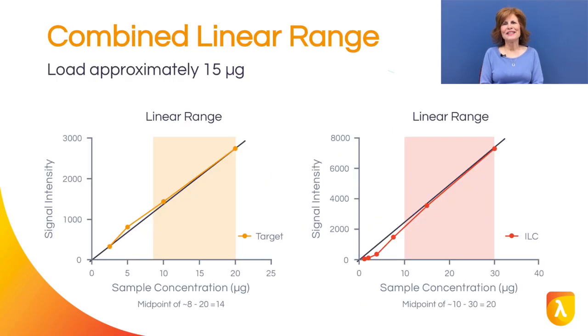After you have drawn the tangents correctly, examine each graph to determine the available sample load range. In linear approximation, the closer you are to the point of tangency, the closer you are to the true approximation of proportionality. The farther away from the point of tangency, the worse the approximation. So, you want to choose your region closer to the point of tangency.